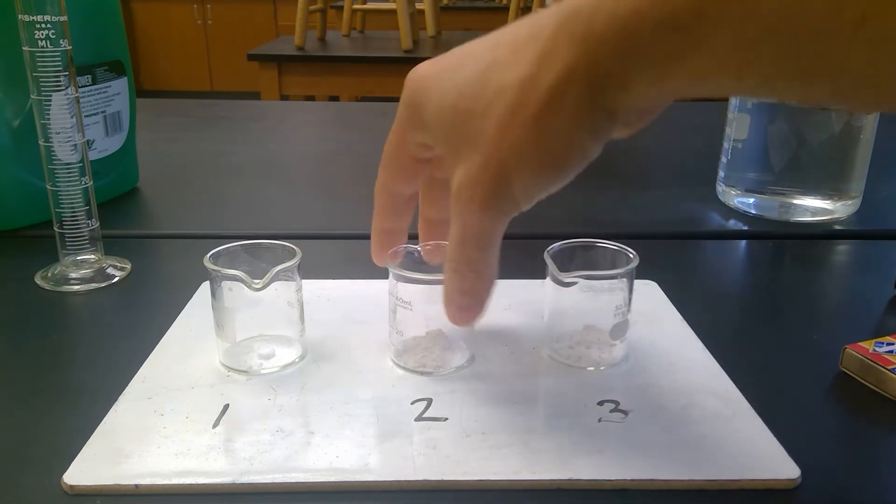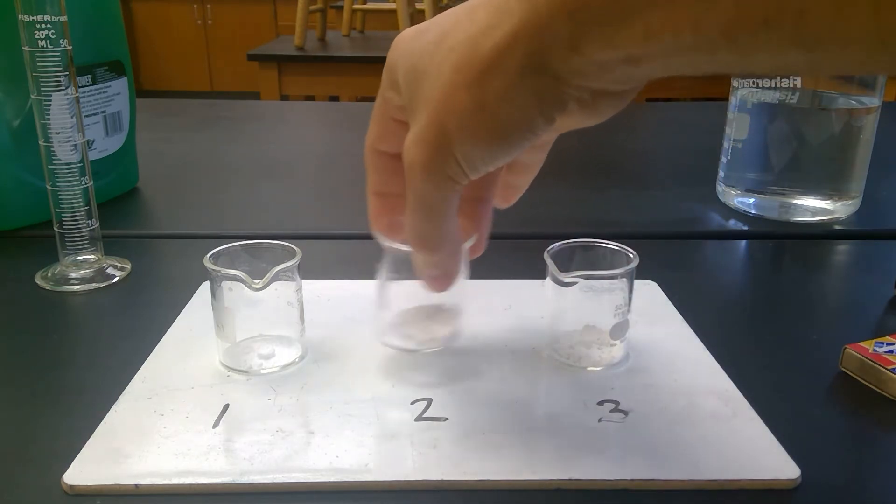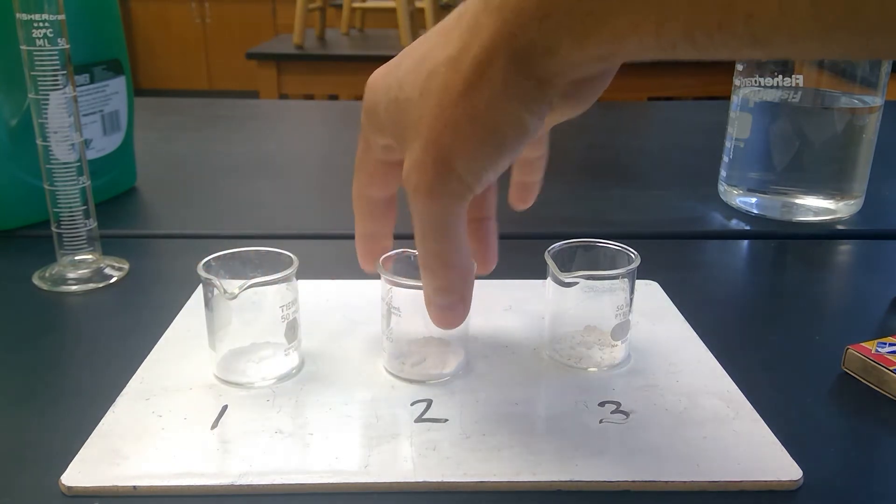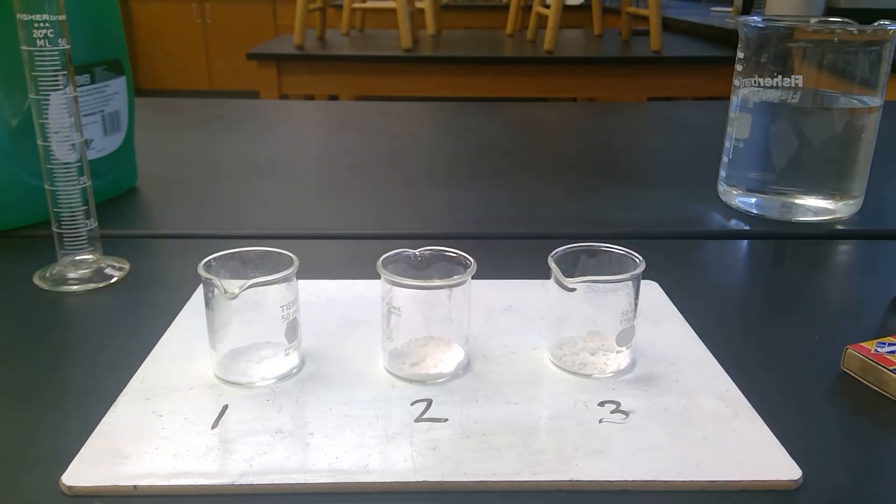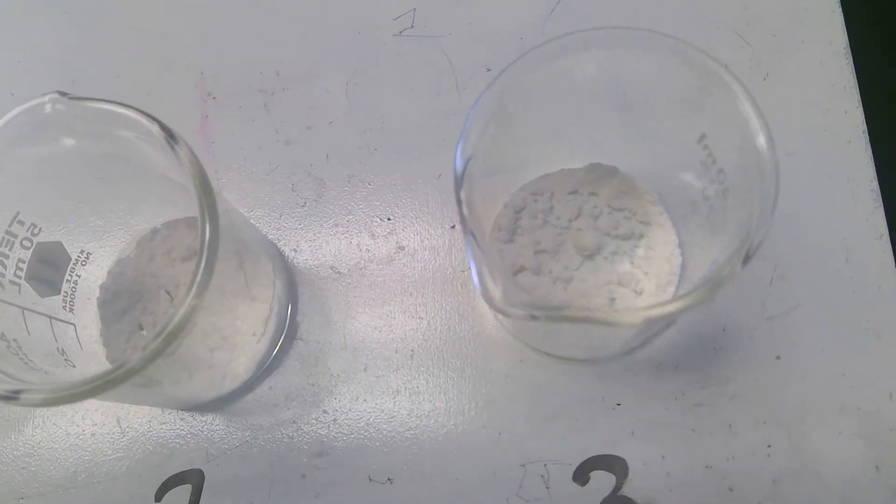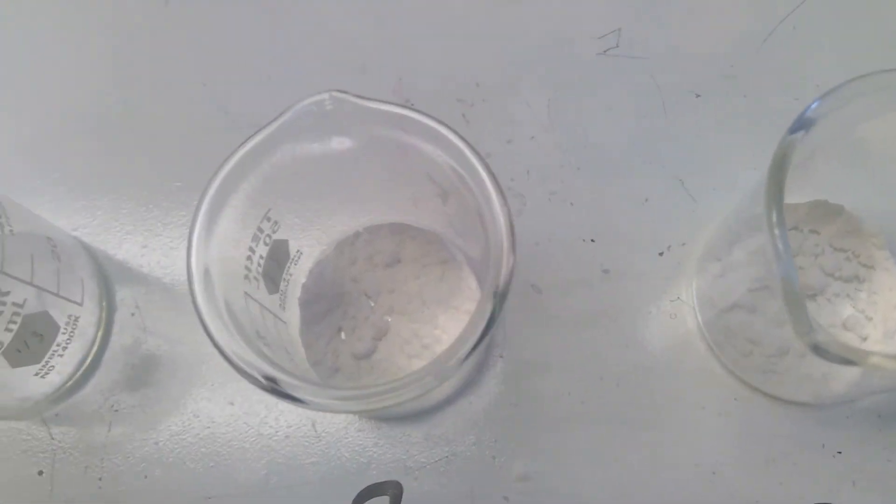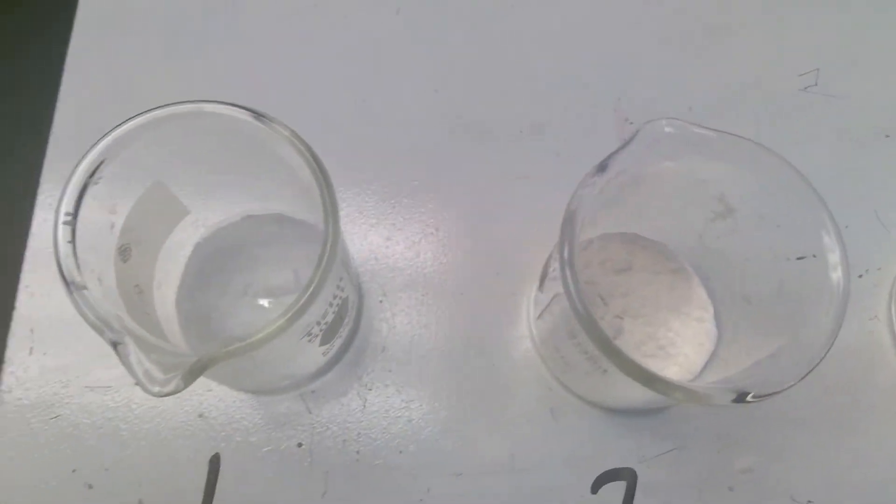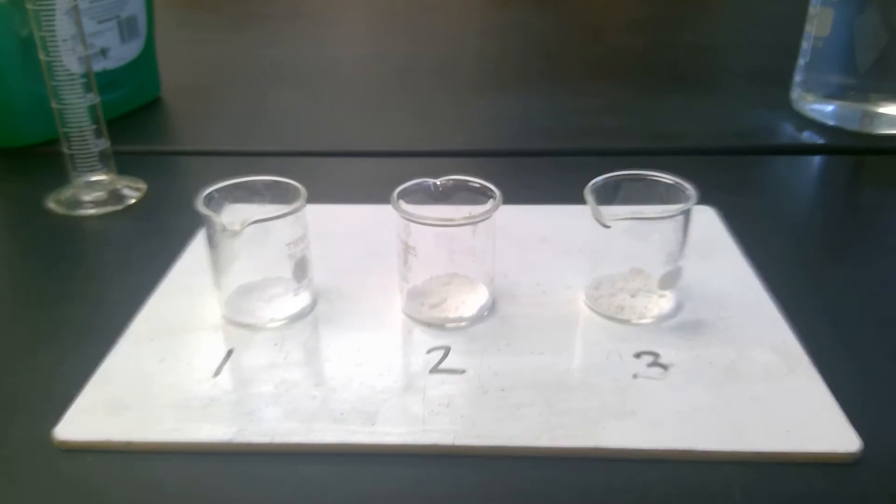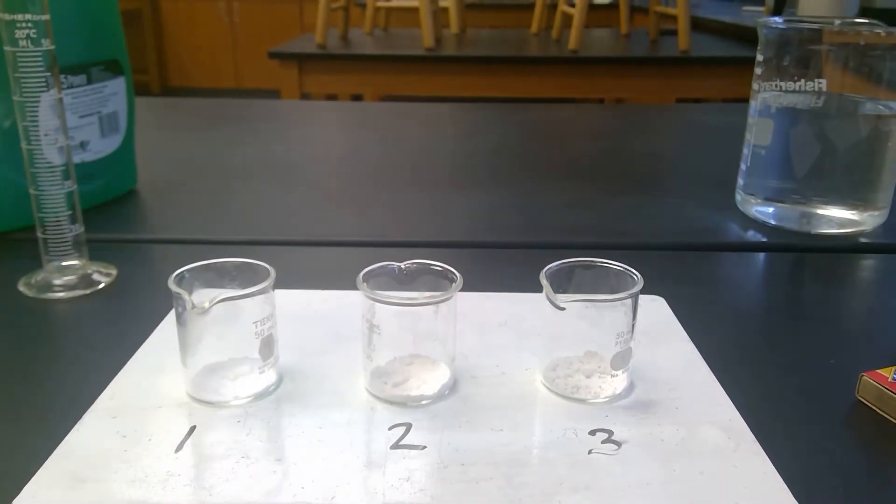Then I'm going to swirl these around to make sure they get nice and mixed up. And I'm going to make some observations of these. So they all look like dry powders. The cream of tartar looks a little bit different than the baking soda, but in general, they look fairly the same.